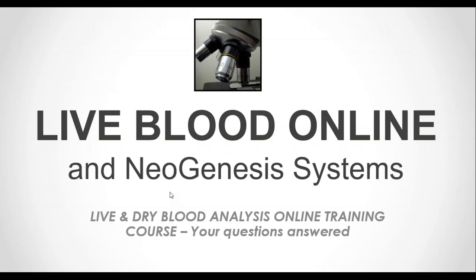Well, yes, there have been a number of studies. Now, it is often called a pseudoscience, and it is criticized in that there's no scientific research behind it, that it's some sort of scam to sell products. However, much of what we see in live blood samples has been researched and proven many years ago already in conventional hematology. There are other anomalies in live and dry blood that were identified clinically by researchers working with live and dry blood analysis over the course of many years.